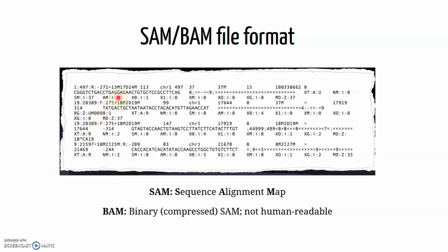Basically this looks sort of similar to our FASTQ files. Remember, the FASTQ files are a huge list of our identifier at the top, our gene sequence, and then a bunch of information related to the quality. It looks like very confusing information here, but this tells the computer certain information about the quality of each base that was called.